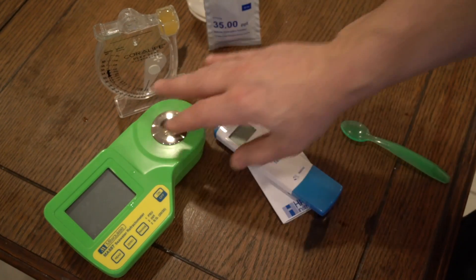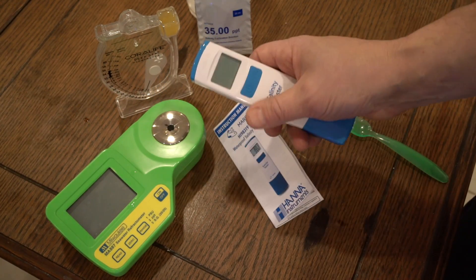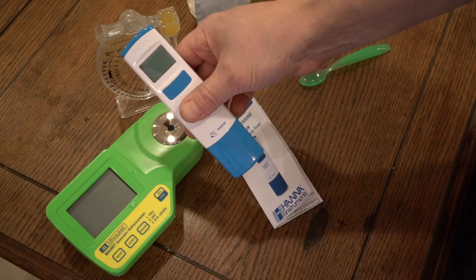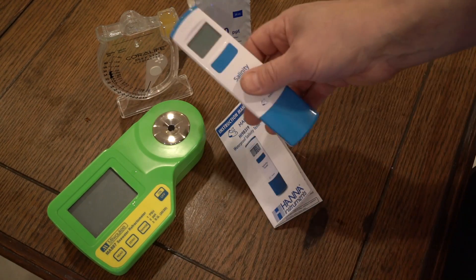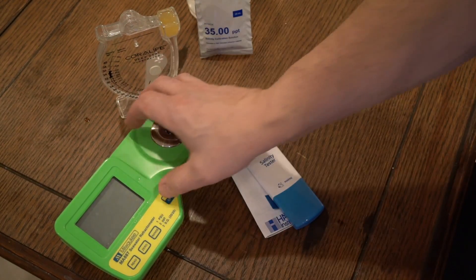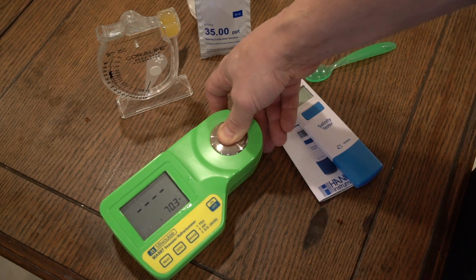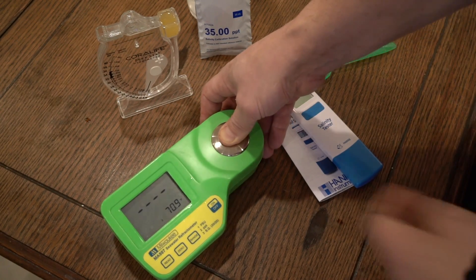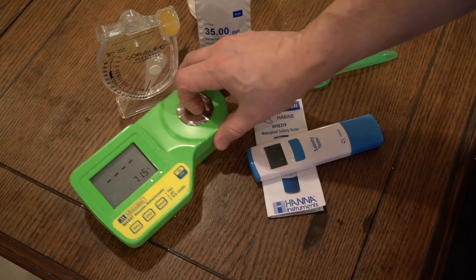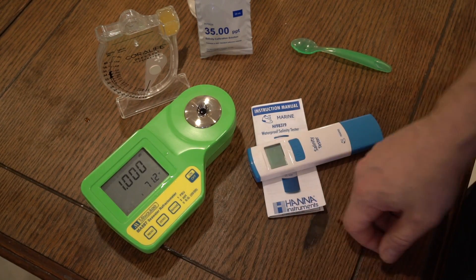They're all different price points. The Milwaukee's at the top, the Hanna's in the middle, and the Coralife of course is at the bottom. And then there's another Hanna on top of it. With the Hanna, you've got to buy that calibration fluid — I know it's only 25 or 35 bucks, but that adds on to it. The Milwaukee is a little bigger, and I've found sometimes I'll get rust between that stainless steel disc and the plastic, so I really have to keep it clean. Someone told me if you pre-warm it with your finger, the temperature will be more accurate. I did not find that the case, and if it is, I'm not putting my finger on there that long — it only got up two degrees. So I just don't trust it for temperature. But for salinity, it's very quick and very easy.